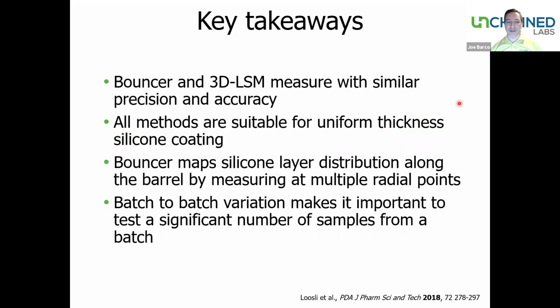And they point out as part of their study that they saw large variations from batch to batch, which makes it important for them to test a high number of samples from each individual siliconization batch, which I'm going to editorialize a bit, means you need some way to quickly measure samples and do it in a way that anyone can walk up and do it. So it doesn't need to be a trained operator working the microscope. It can just be a trained technician who can feed samples into that device without creating a complicated process. Okay, so that's the first paper.